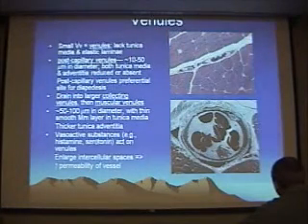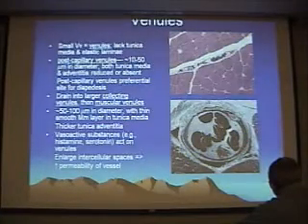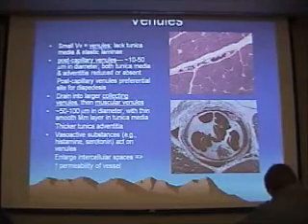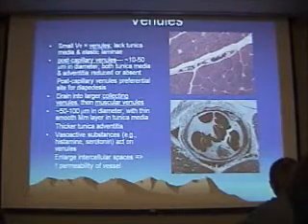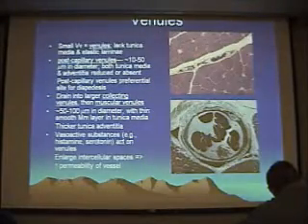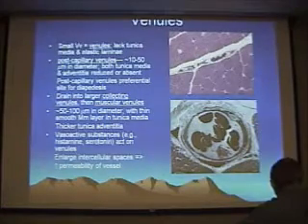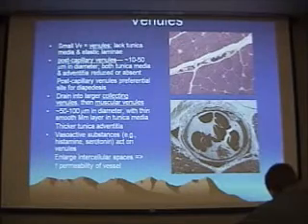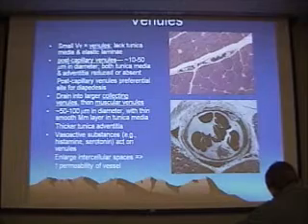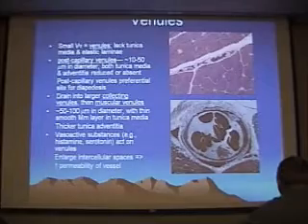Here's an EM of the venule. You can see the tunica intima, the endothelium, and the nucleus of the endothelium. Here you can see a little bit of media and then a few wisps of collagen making up the tunica adventitia — so this is going to be a small venule. When you look at these, kind of go with your first gut impression. Don't overanalyze them too much, because your first guess is probably right.